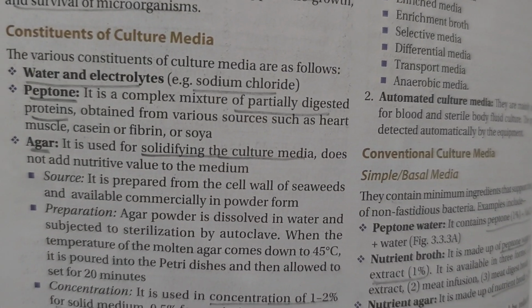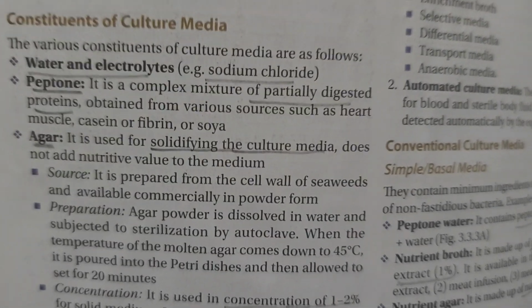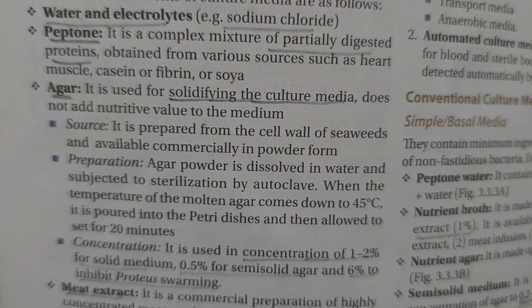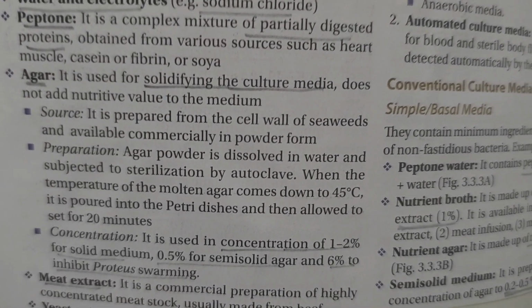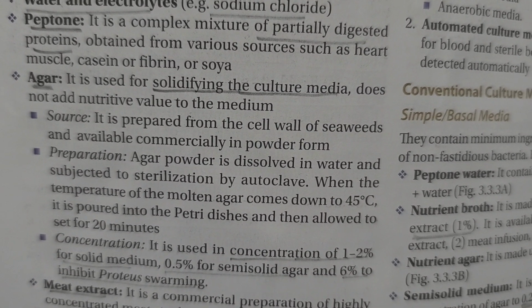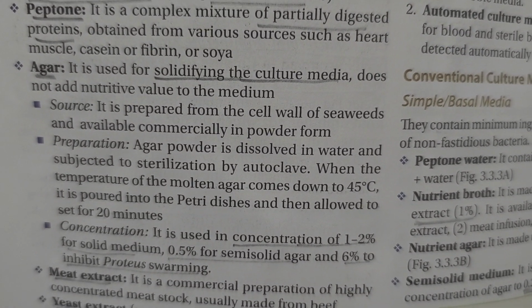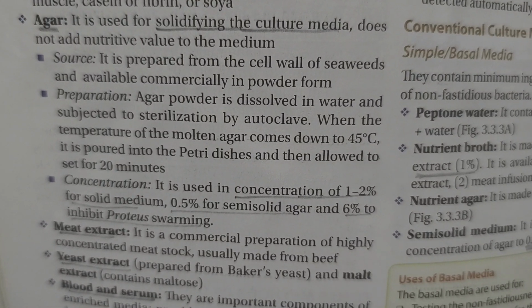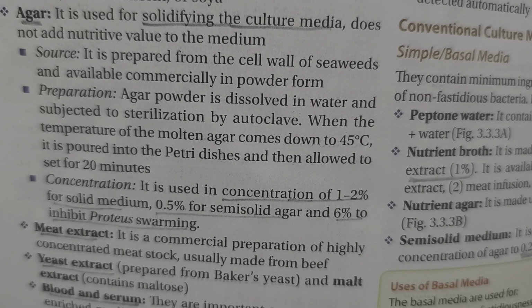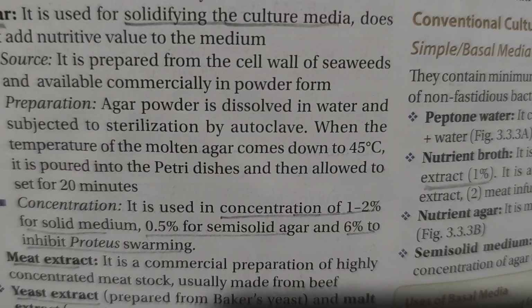Constituents of culture media are water and electrolytes, for example sodium chloride; peptone, a complex mixture of partially digested proteins obtained from various sources such as heart muscle, casein, fibrin or soya; and agar. Agar is used for solidifying the culture media and does not add nutrient value to the medium.